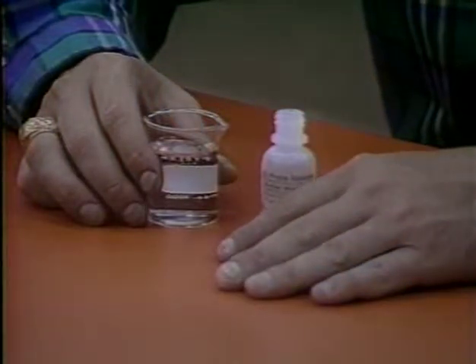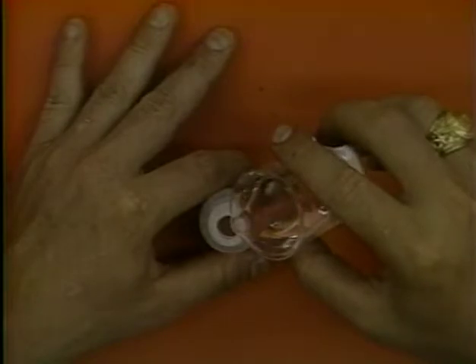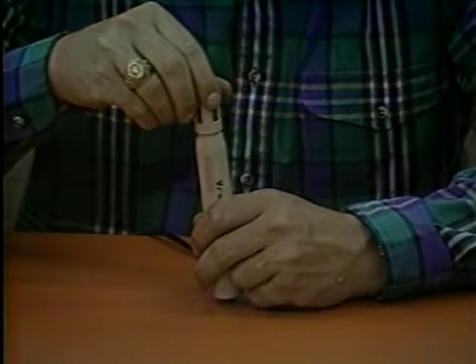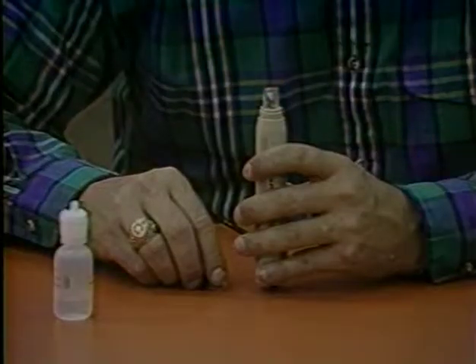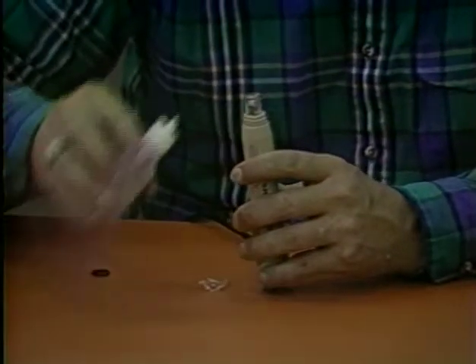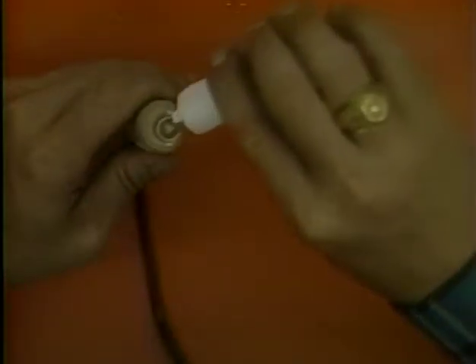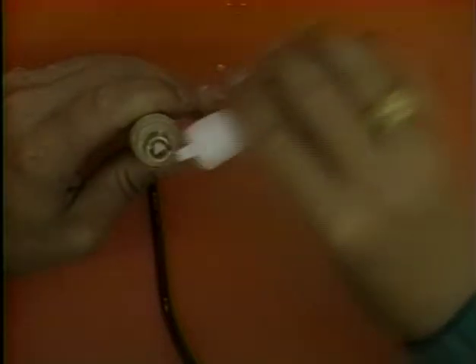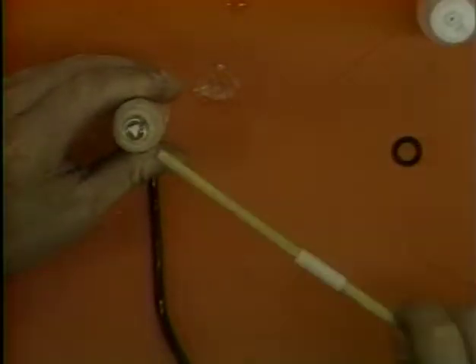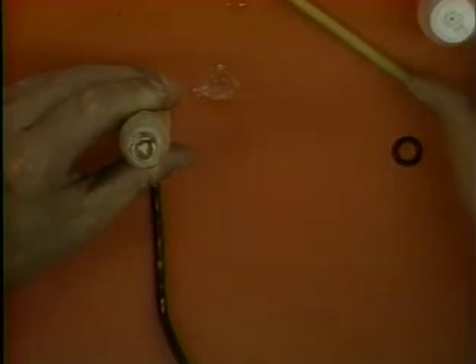Prepare the potassium chloride probe solution by dissolving the crystals in distilled water. Unscrew the protective cap and remove the O-ring and the old membrane. Rinse the exposed sensor thoroughly with the probe solution. Grasp the probe in your left hand and fill the sensor body with the probe solution while pumping the diaphragm button with a pencil. Continue to fill and pump until no air bubbles are present.